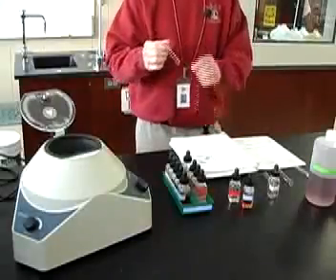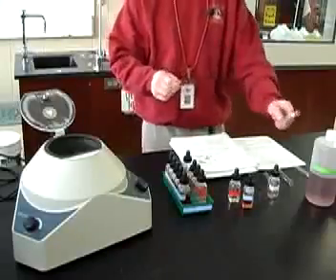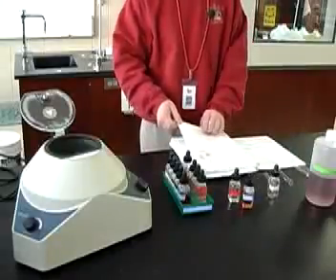And then make sure to label it really, really well, because remember there's other people doing labs in here too, and then you can set that aside in your lab station. Don't trust your memory, write it down.